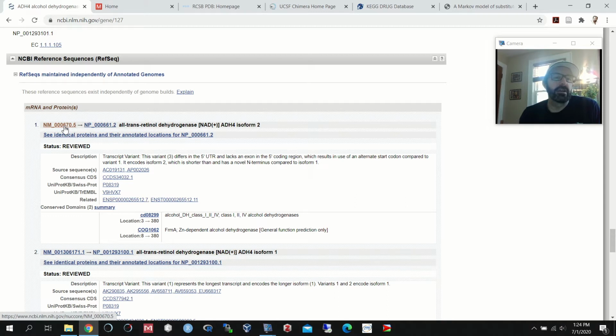If you get other DNA sequences in this NCBI reference sequence or RefSeq download, some of these can be quite large. A lot of times sequencing projects have very large contiguous sequences, or contigs, that are assembled, and these have many, many genes on them. If you pull them down in MEGA and try to analyze them at the gene level, you're going to have very huge sequences that take very long periods of time to align. If your alignments are taking a really long time, it's a sign that you've pulled down sequences that are way too large. And what you really want are probably these mRNA sequences.